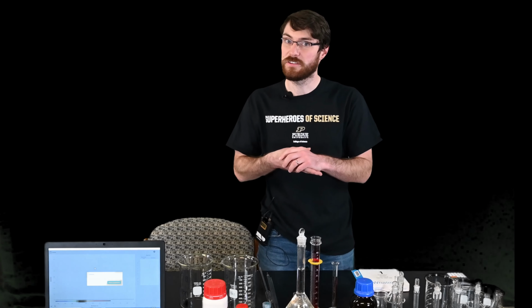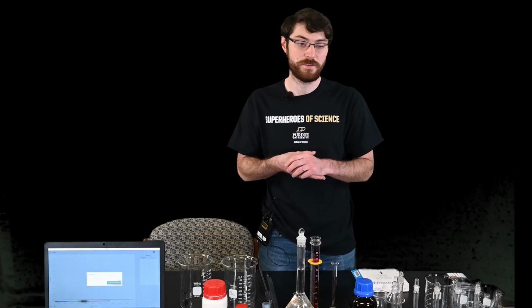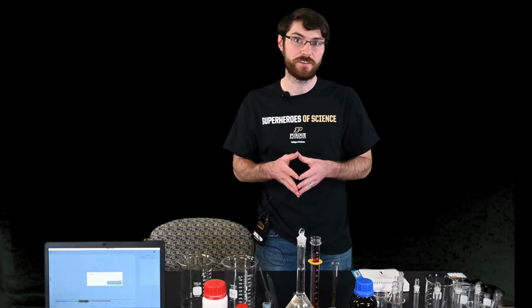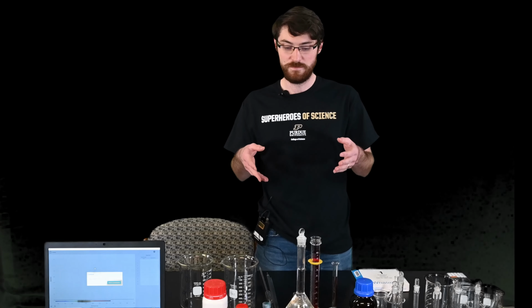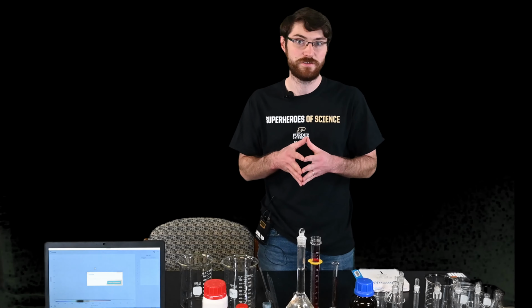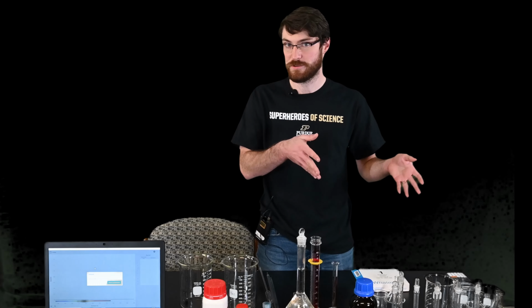Iron can also signal a host of other problems, so high iron concentrations commonly accompany things called acid mine drainage, and if left untreated, that will make the water eventually become inhospitable to life. So that's why we care about this, and we're going to run through a procedure for hopefully accurately determining the concentration of iron in a river water sample, in our case, the Wabash River.